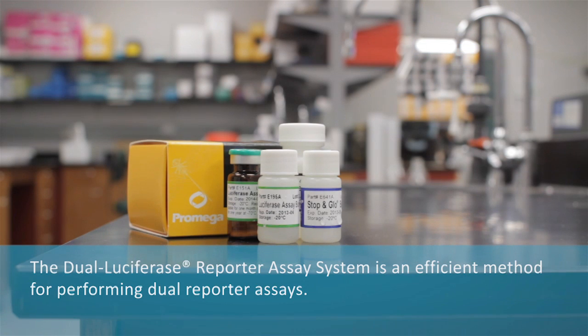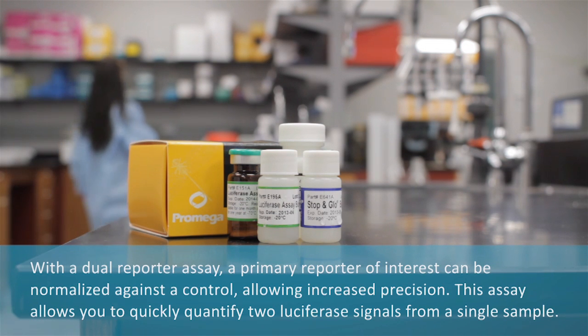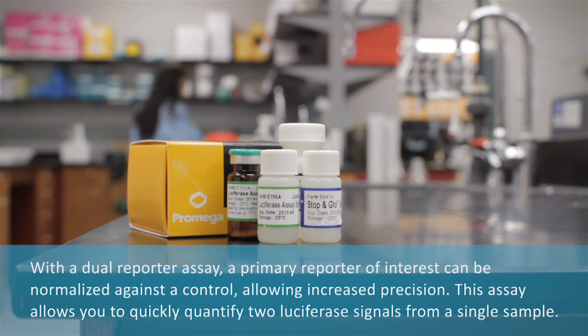The dual luciferase reporter assay system is an efficient method for performing dual reporter assays. With a dual reporter assay, a primary reporter of interest can be normalized against a control, allowing increased precision. This assay allows you to quickly quantify two luciferase signals from a single sample.